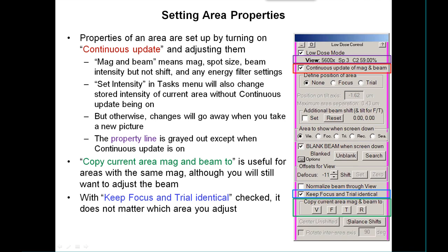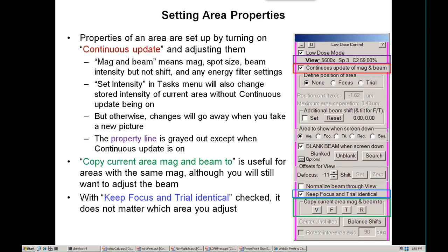The area properties can be set up by turning on the continuous update button and then adjusting properties. The term mag and beam refers to magnification, spot size, and beam intensity — but not beam shift — and it also encompasses any energy filter settings. An exception is that you can use the set intensity item in the task menu to change the intensity, and it will affect the intensity for the current area even without continuous update being on. Otherwise, if you haven't got continuous update on and you adjust the magnification and beam, all that will go away when you go to take a new picture. The property line for the current area will be grayed out, indicating those are just fixed properties.